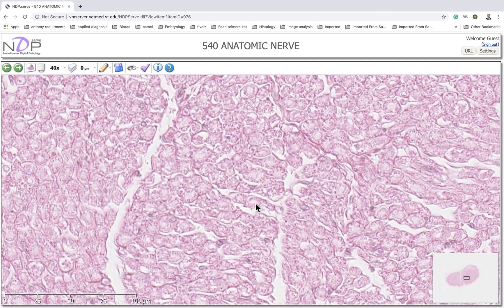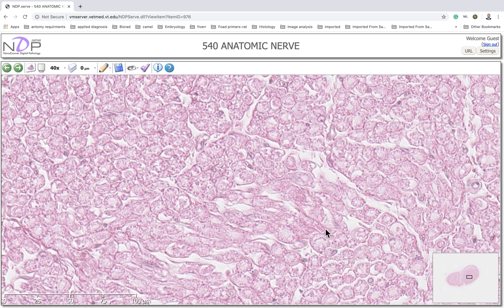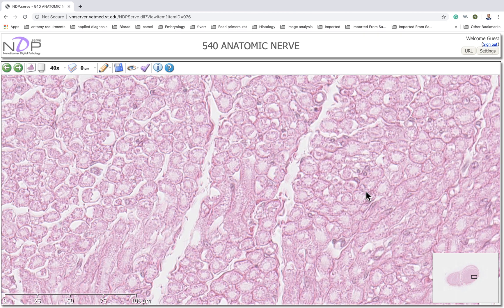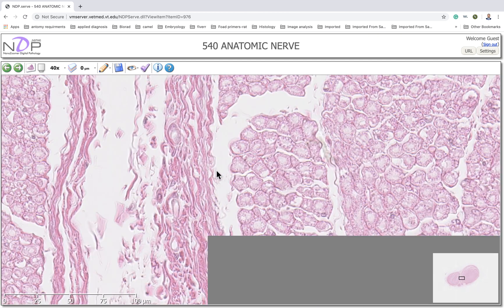In the same nerve we could find both myelinated and non-myelinated axons. This is a myelinated axon and this is the myelin sheath. If we could not resolve the myelin sheath, then the axon would be non-myelinated. But here, most of these axons are surrounded by the myelin sheath.